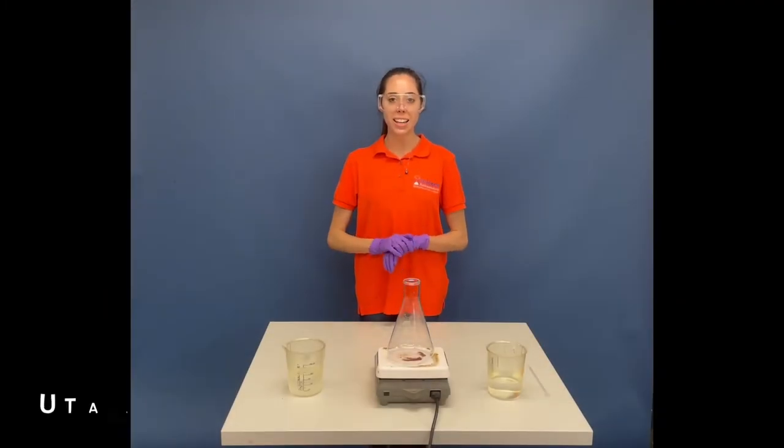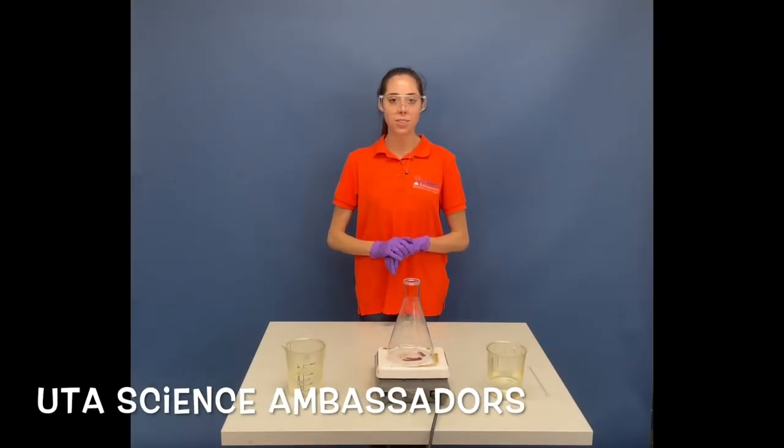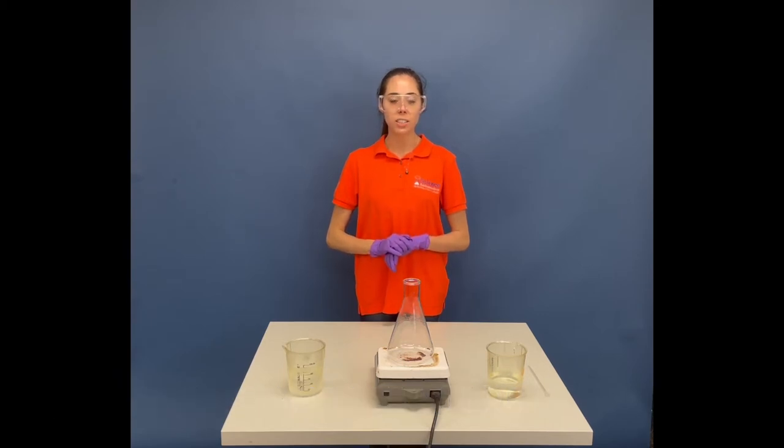Hi, my name is Lydia. I am a science ambassador here at the University of Texas at Arlington, and today I'll be showing you guys a Briggs-Rauscher oscillation reaction, also known as an oscillating clock reaction.